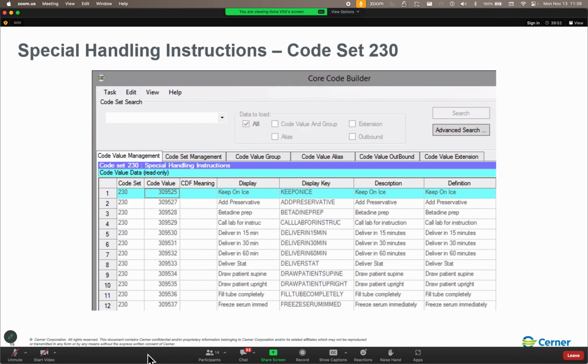We had 4 characters for our accession number of the day. So now we're up to 9. And we had our container ID, which would be in our barcode. So now we're at 10 characters. 10 characters is less than 12. We're good. If we decide to increase our sequence from 4 to 5 or 5 to 6, we're still good.